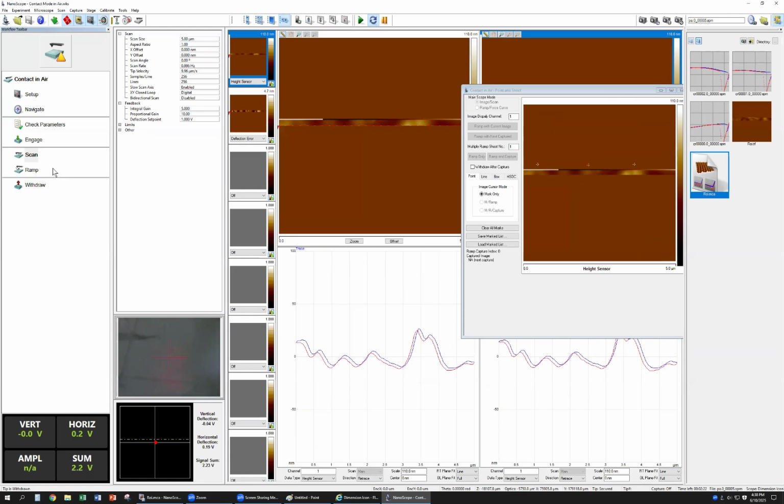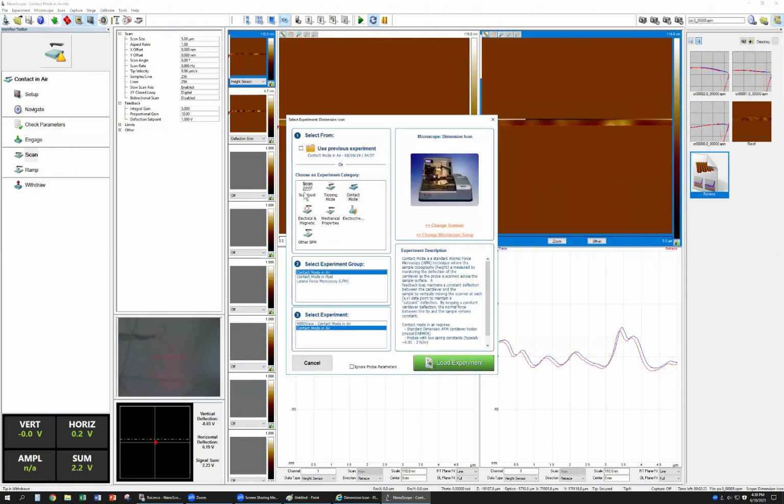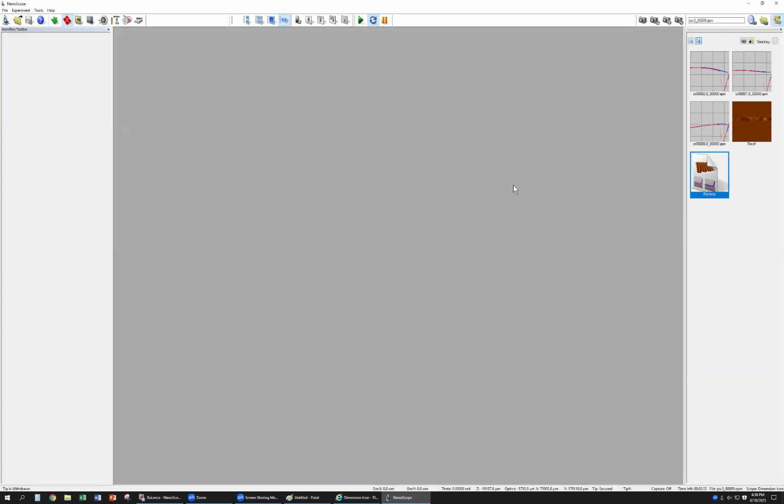Because the sensitivity has the lateral force, the sensitivity will be low. So if you want to use another kind of method to get the force curve, we can go back to ScanAsyst or the QNM. Inside the QNM, you can also get all kinds of force curves, all points' force curves.